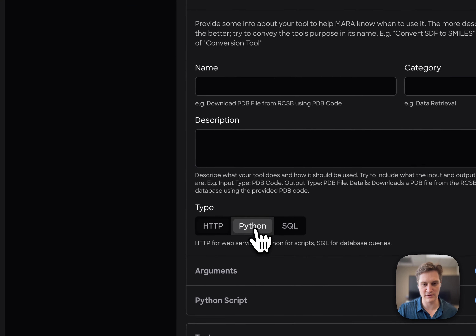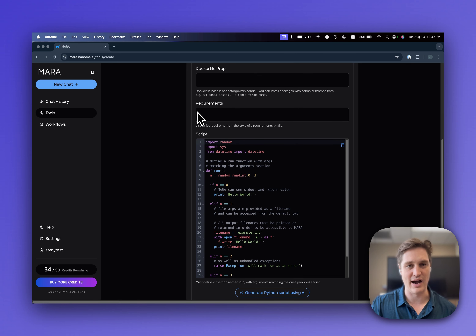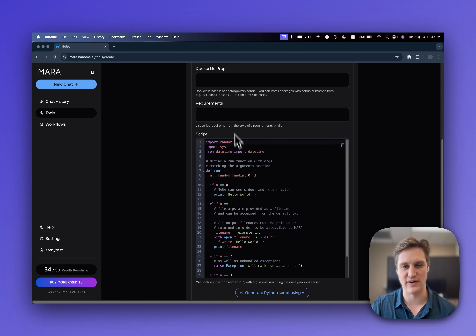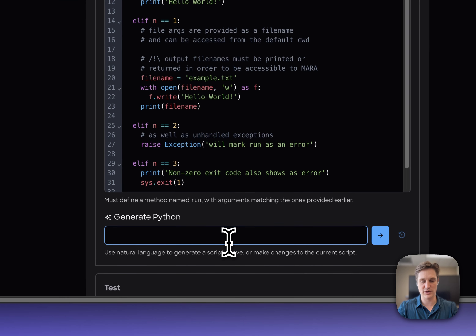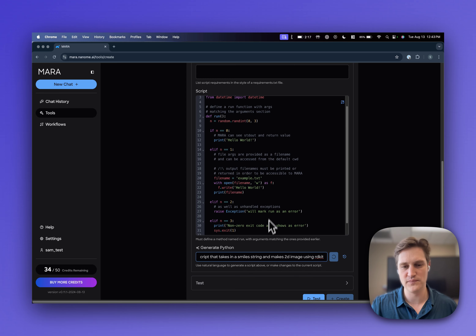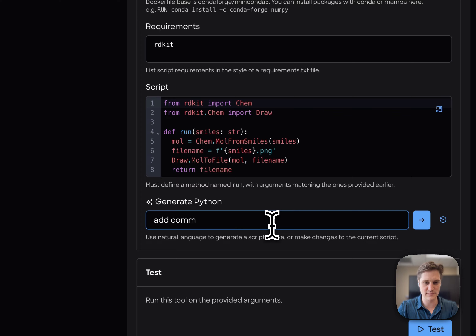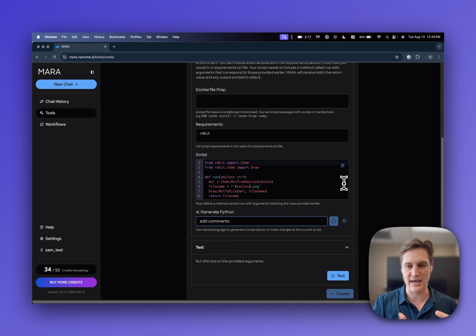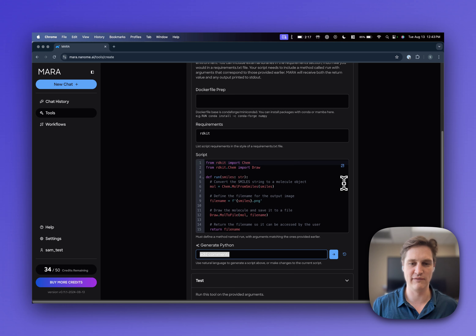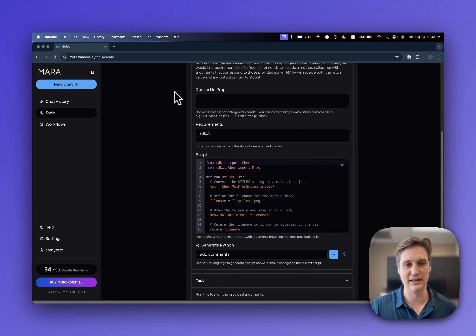Another tool creation option is Python. This allows you to paste in a Python script that can be immediately leveraged by your entire organization. You have access to fill in the Dockerfile prep as well as the requirements.txt file, or you can use AI to generate this. Say if I wanted to write a script that takes in a SMILES string and makes a 2D image using RDKit — just like that, we go ahead and generate it for you. You can test each tool easily. You can even ask to add comments. Scripts you've used for orchestrating parts of your informatics workflow can be saved where they're immediately available in chat to others in your organization, and all tools instantly become REST API endpoints accessible via their tool ID URL.